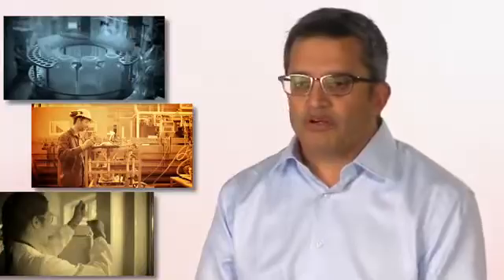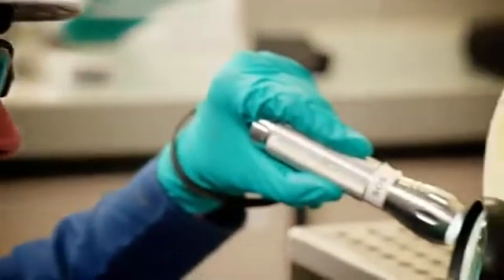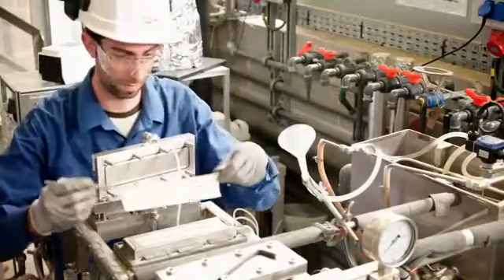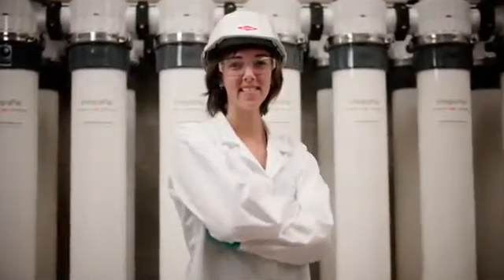These are not trivial things, and so when we deal with very large problems, whether it's desalination or cleaning up impaired waters, people come to us, they look for solutions, they look for expertise. And that's what we've delivered over the last six decades.